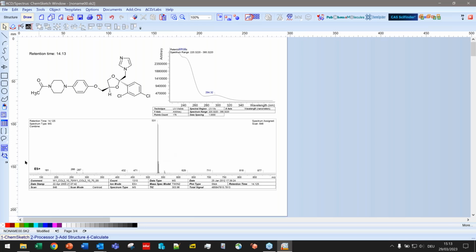So the nice thing is that the zooming function or the inset function is also available for mass spectra. So if you want to zoom into mass spectra, you can also do that. In this case, the analyst might be interested in the splitting of that peak here. So I'll just grab it and put it next to the spectrum and let me resize it. That way, a nice inset, just showing the isotopic pattern for this peak here.